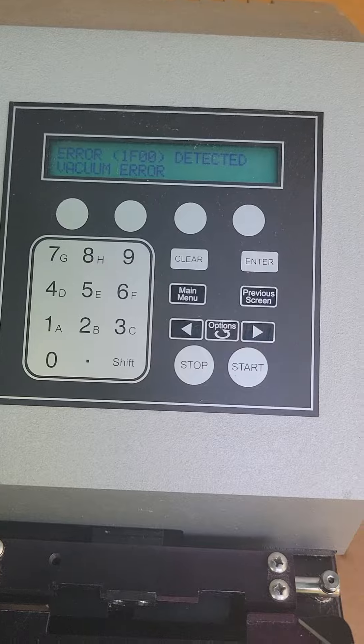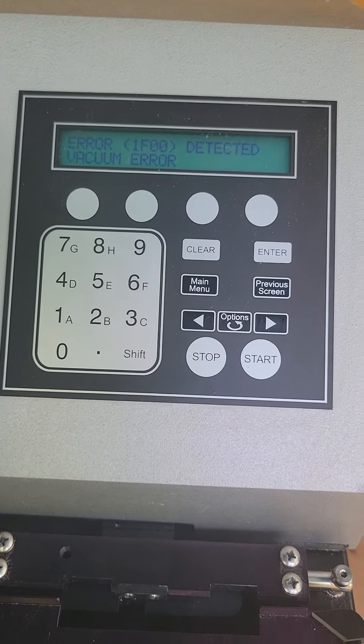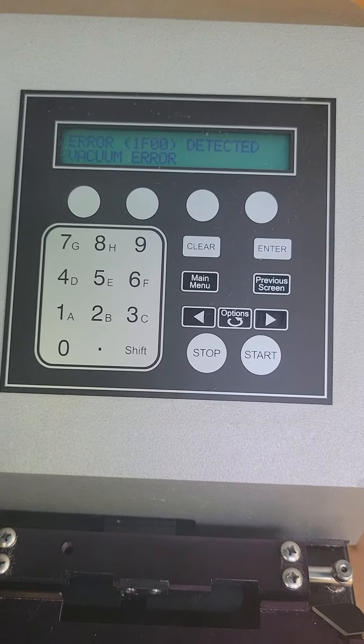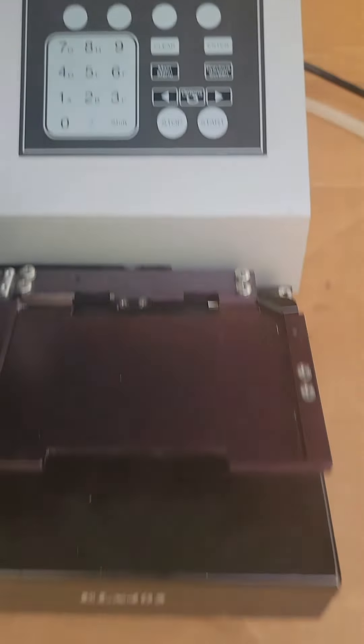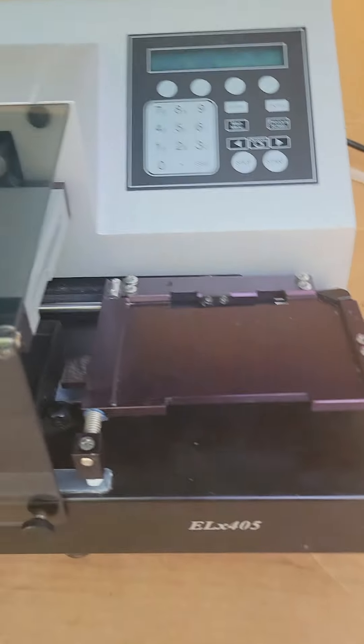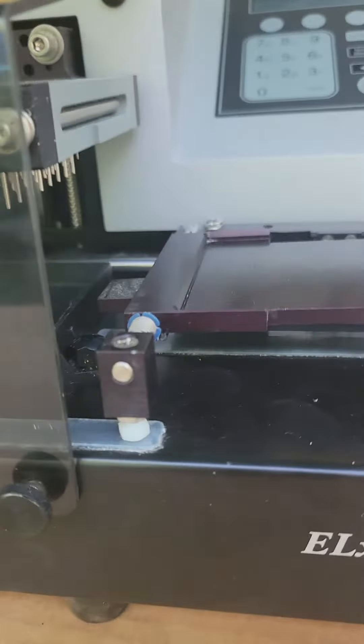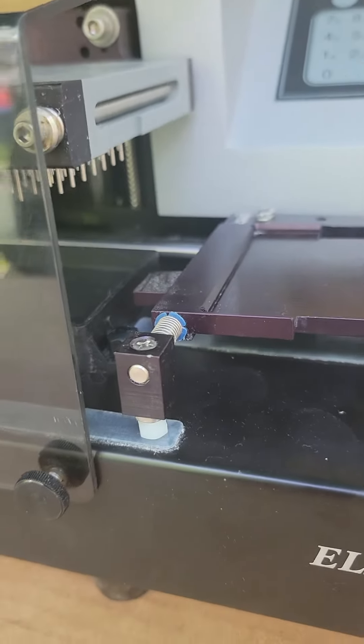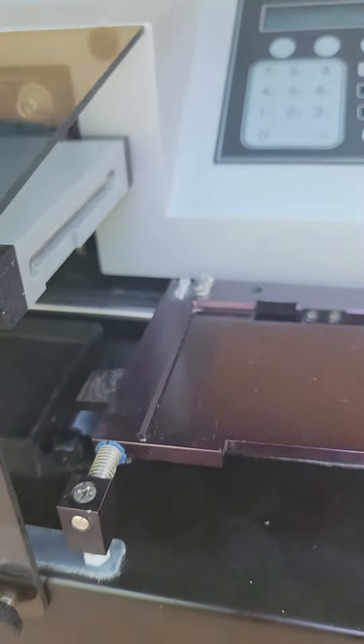So of course there's no vacuum, so it's going to detect an error. You need to install it with the vacuum. Beautiful unit, nothing wrong with it.